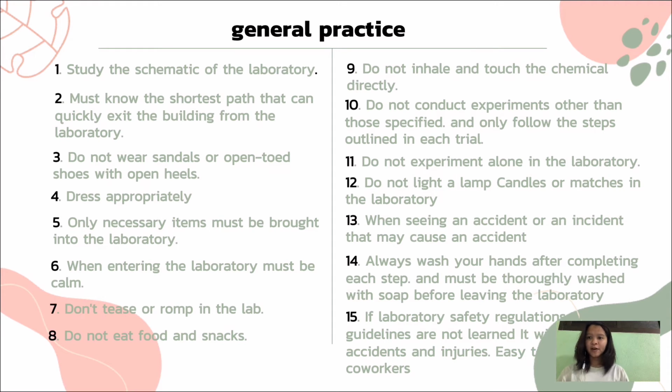Number 9. Don't inhale or touch the chemicals directly. Number 10. Don't conduct experiments other than those specified, and only follow the steps outlined in each trial.